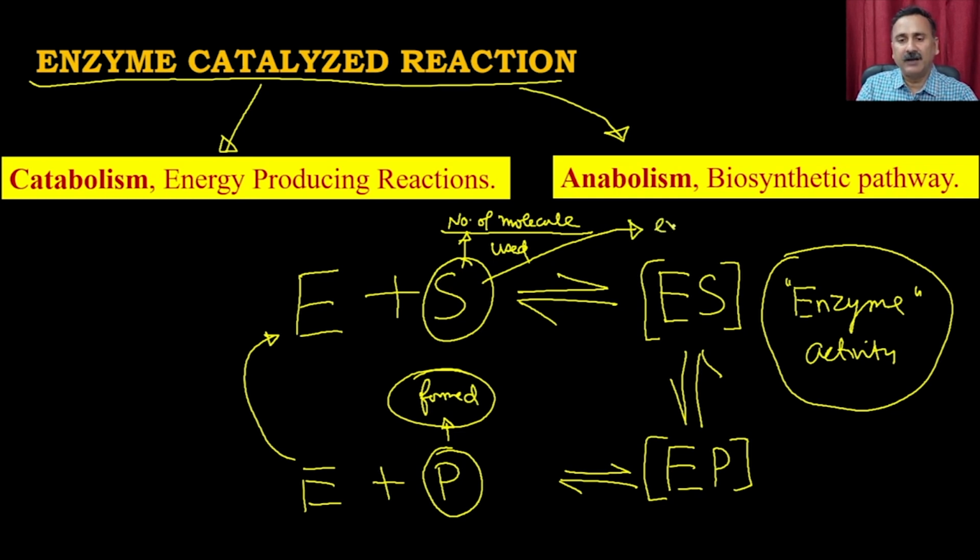What is meant by an exclusive property is that it will not be present in any other species throughout this particular cycle. If you are measuring the substrate, it should not be that the product is very similar and gives you similar reactions.